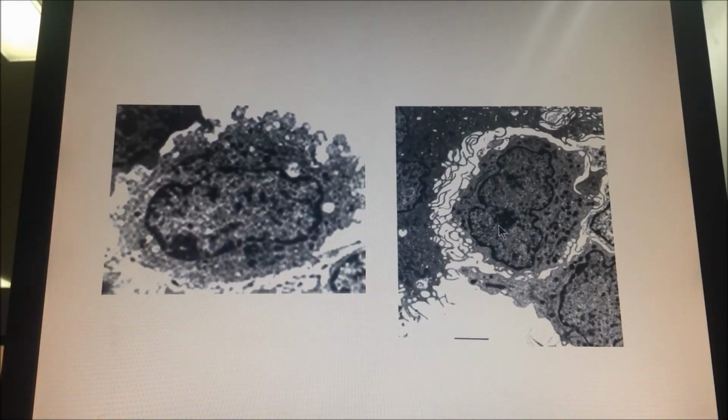Inside the nucleus you have multiple nucleoli. هاي هون في two nucleoli in the macrophage. زي ما شايفين النيوكليوس هل هي in the center of the cell ولا جاي طرفية بعض الشيء؟ Yeah, the nucleus of the macrophage is peripheral or eccentric. The cytoplasm, on the other hand, مليان هدول البلاك granules. These are lysosomes. طبعا الماكروفاج is a phagocytic cell. وظيفته تعمل phagocytosis, so you need a large amount of lysosomes.